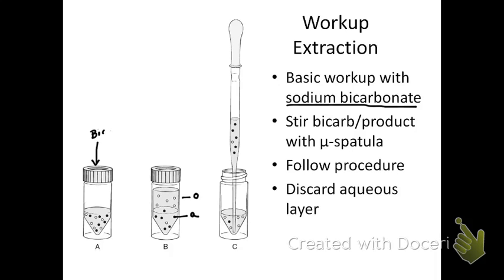Now, you should verify that by looking up the densities. Those are some of the types of data that you need in this experiment. If you're going to do an extraction, you'll need to know what the densities of the liquids are, and keep that in mind for future laboratories.